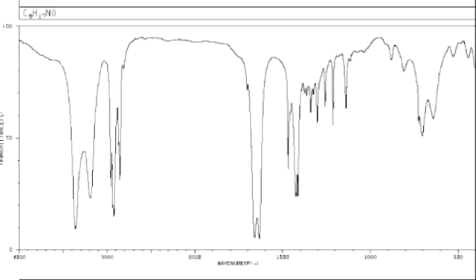Okay, so looking at this molecule, it's immediately interesting because we see two very strong, sharp peaks like we normally would expect for carbonyl, but they're between 1600 and 1700, not between 1700 and 1800. So that's immediately interesting. Also, we see really strong absorptions around 3400 and 3200, but we know that's not from an amine because those would be weaker, and we know it's not from an alcohol because it's not broad enough. So what is this?